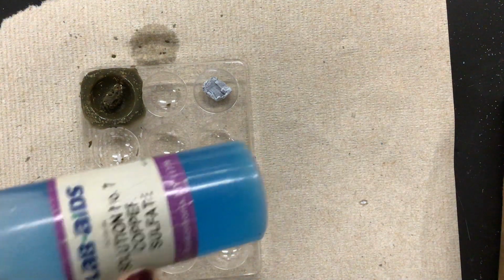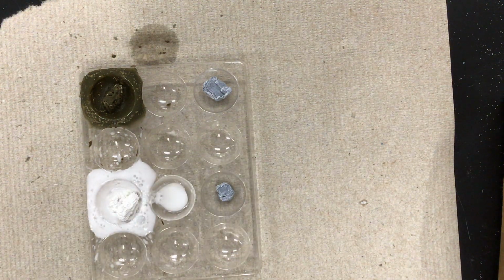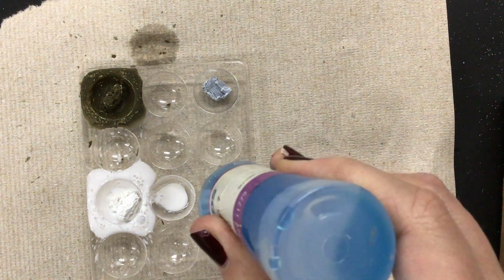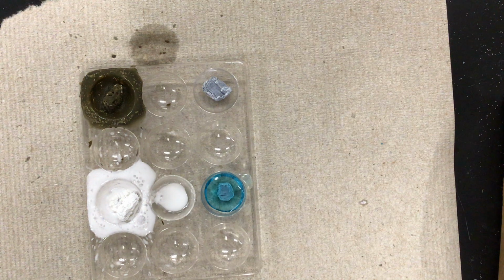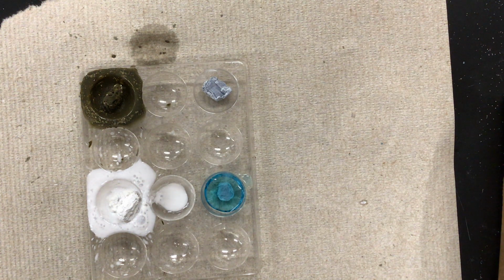The third solution is copper sulfate. So again, this is copper sulfate and calcium. And let's see if it has the same type of reaction. There it's starting to produce a gas. I bet it's going to do something very similar to the first two.